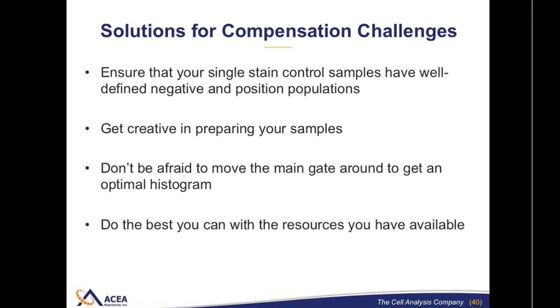Finally, I would like to end by sharing that I recognize in real life we sometimes have to make choices to do our science, and we're not always able to follow best practices to a T. So I hope the information that I've shared with you today will allow you to at least make informed choices about single stain controls in your future flow cytometry experiments.